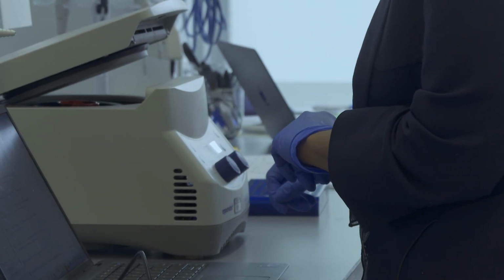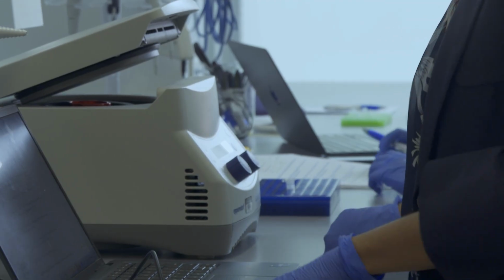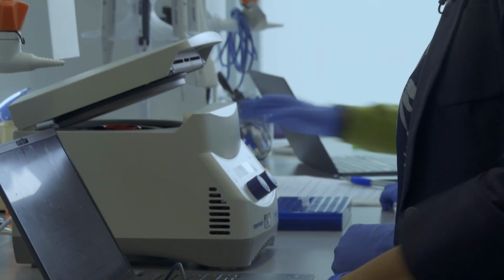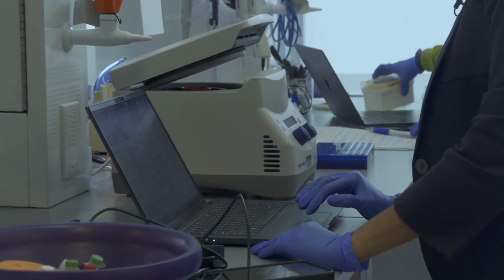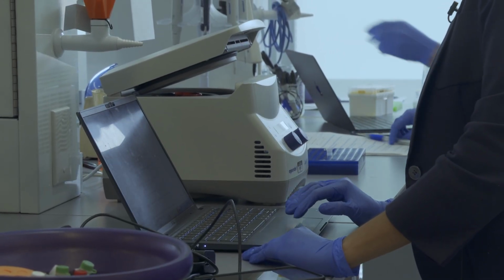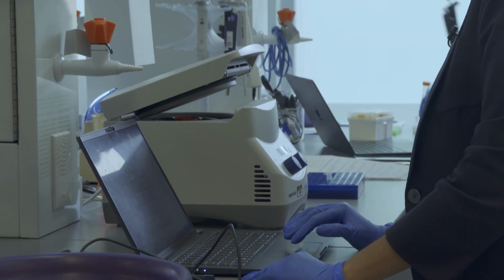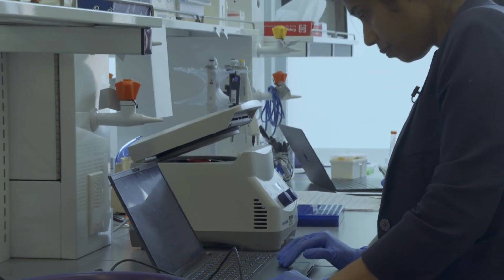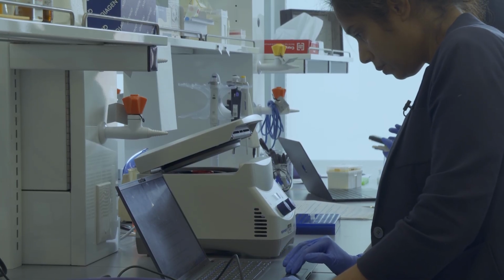Yeah, I need to make it from the calculations. Sure. I think that's good. Yeah, that is not a good one. Which is like I think 2 or 3 microliters right there. Just a lot of water.